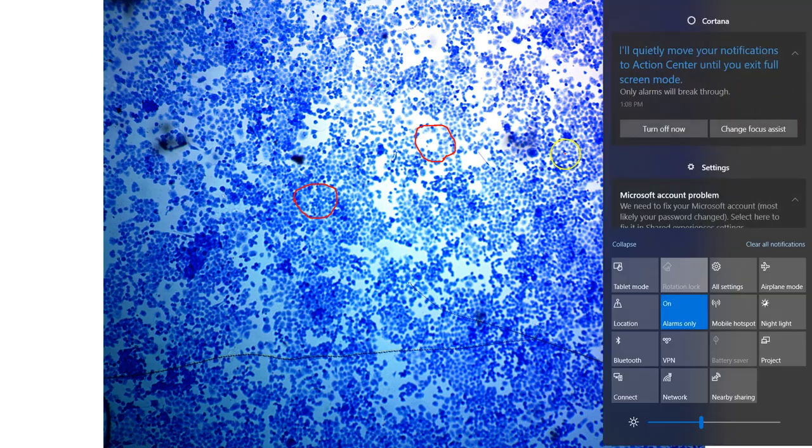So in this one, this is a lower magnification. This is a scanning objective lens observation. Looking at this, you see that again a significant portion of the surface area of the vessel is covered with cells, and you're going to be looking for those blues again, and I would say that maybe between 85 to 90+% is covered in cells.